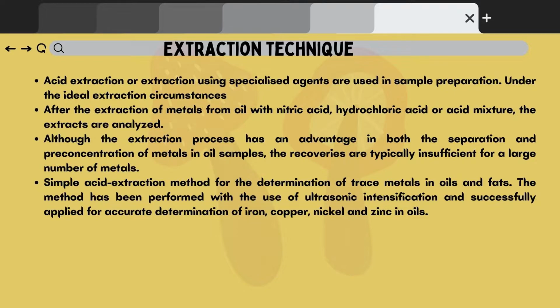Simple acid method for determination of trace metals in oil and fats. The method has been performed with the use of ultrasonic intensification and successfully applied for accurate determination of iron, copper, nickel and zinc in oils.